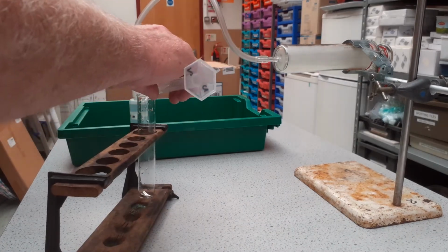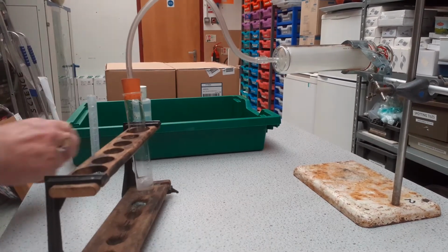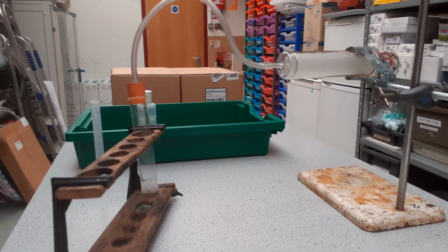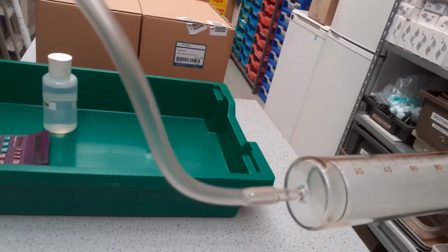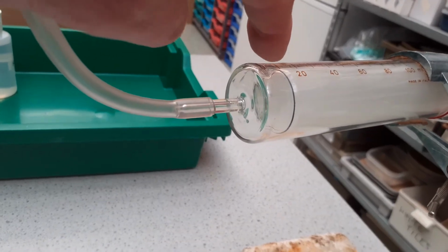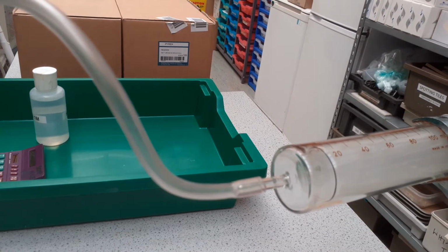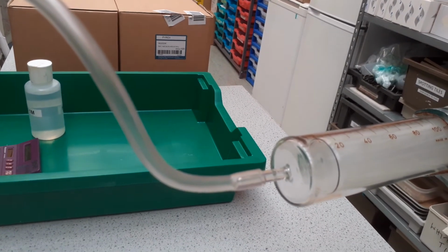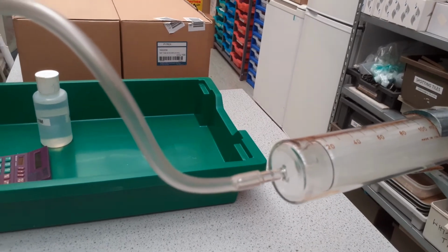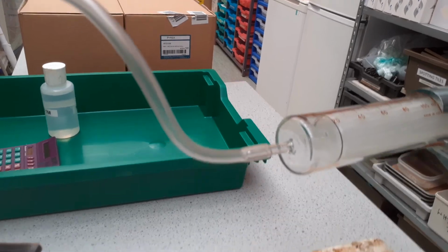So I'm adding the acid, and immediately then I'm getting the bung in to collect the gas produced. Now, as you can see with the gas syringe, this line tells you the volume of gas being produced. As you can see, it's being pushed out as the magnesium reacts with the hydrochloric acid to produce hydrogen gas. Now what we're looking to measure is how much gas is produced in total.